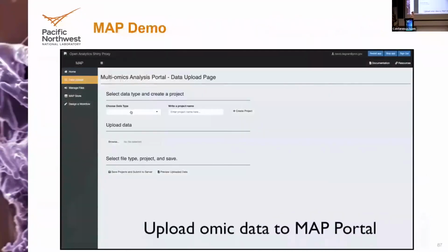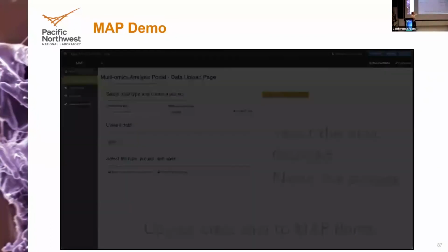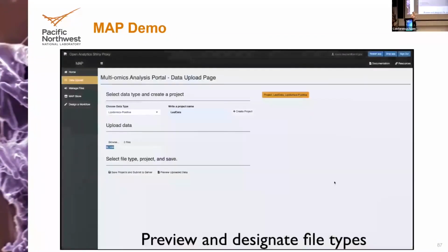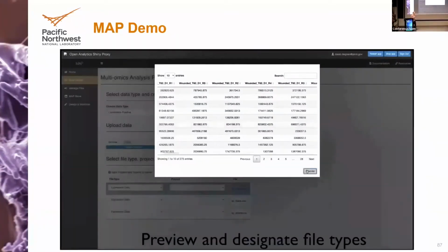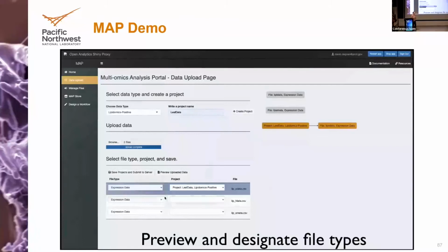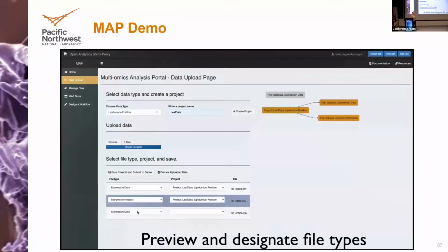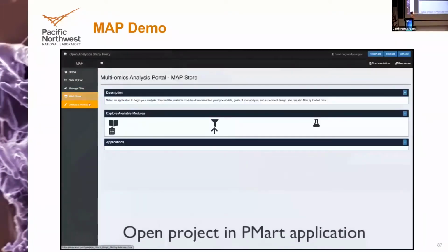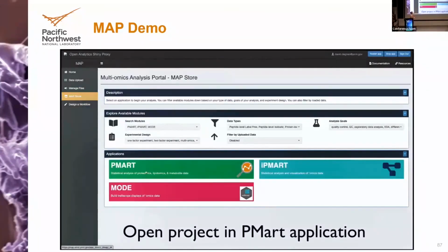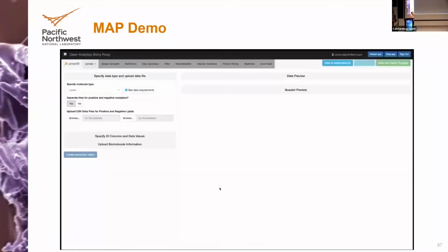to hear more. So just to give you guys an idea of what MAP actually looks like, we have a short demo here. The first step, we obviously need to upload our data into the application. Right now, we support direct upload through CSVs, but we're also working with the Nexus team to be able to directly access any data generated from EMSL user proposals. After you do all your uploads, you can access different applications and just click on it. And what the app will do, it will seamlessly load all of your data into that application.